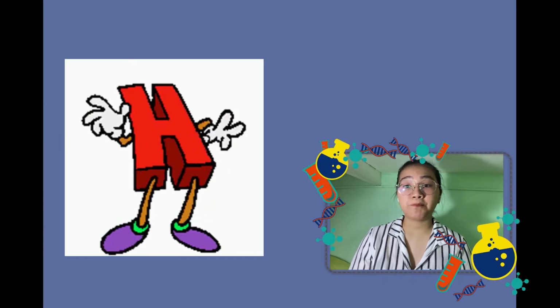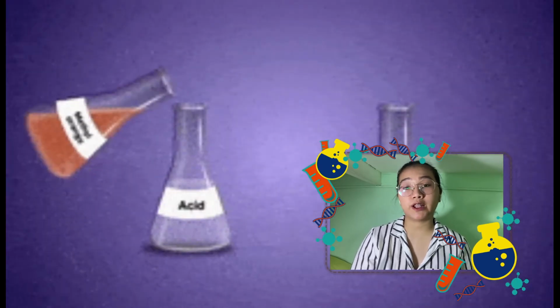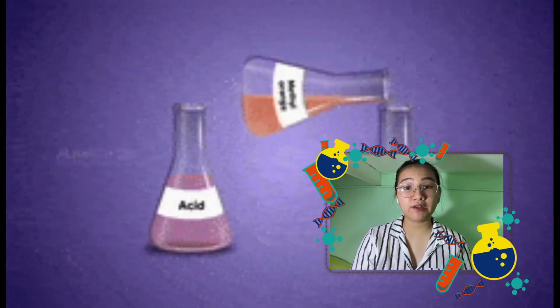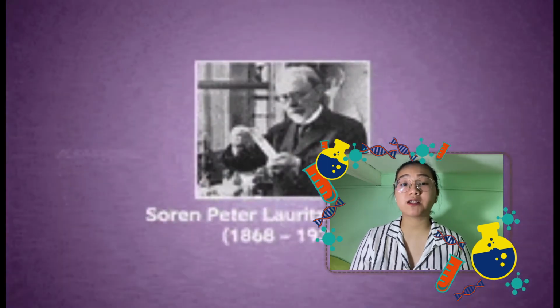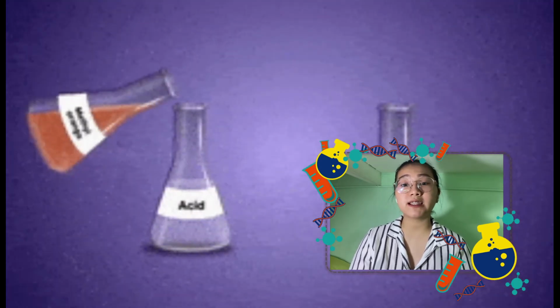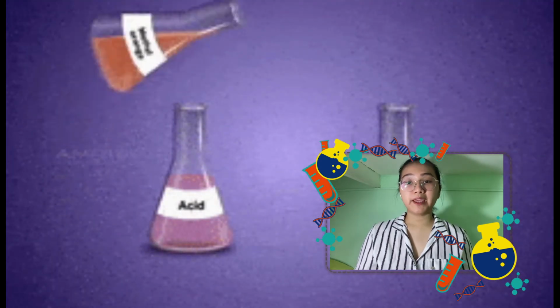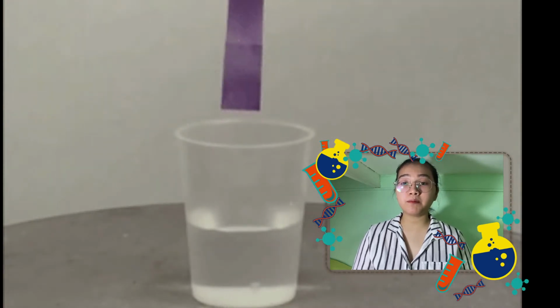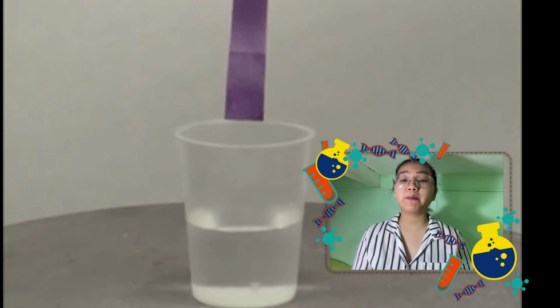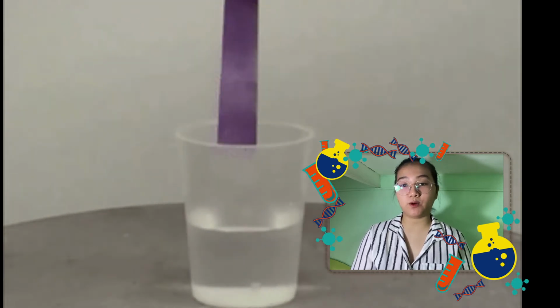The importance of pH is that it can control the nutrient availability, biological function, microbial activity, and chemical behavior. Because of this, we need to monitor and control the pH level of many things for a reason. pH measures the corresponding amount of free hydrogen and hydroxyl ions in the water. It measures how acidic or basic the water is.